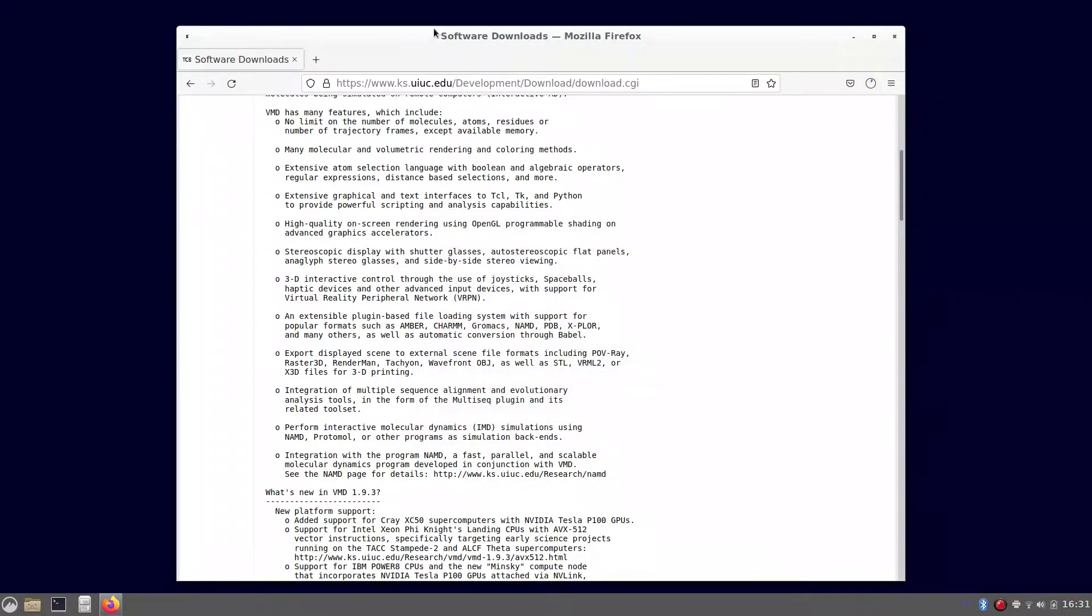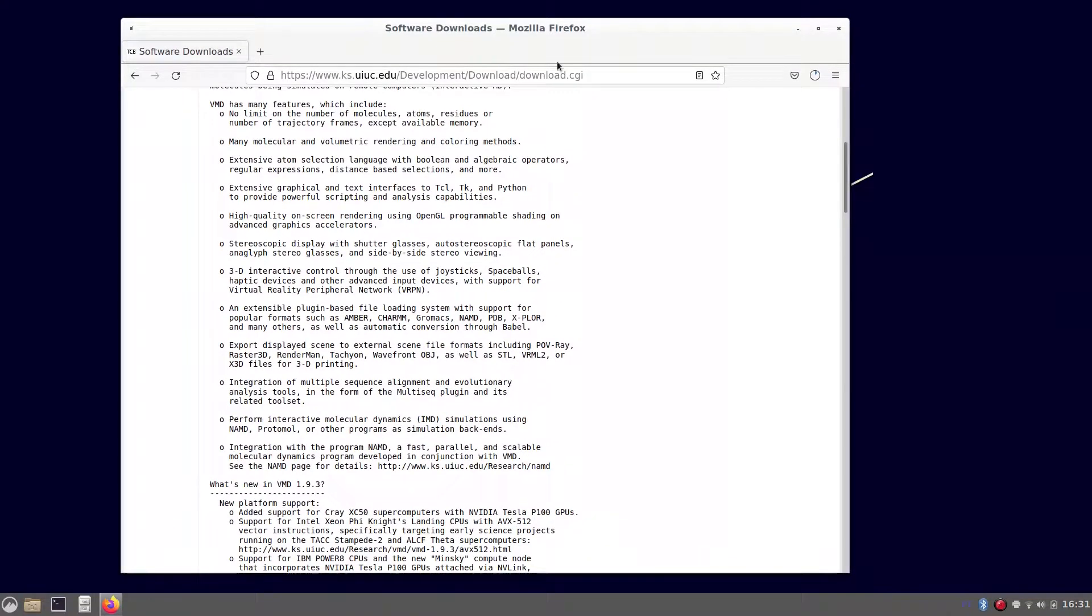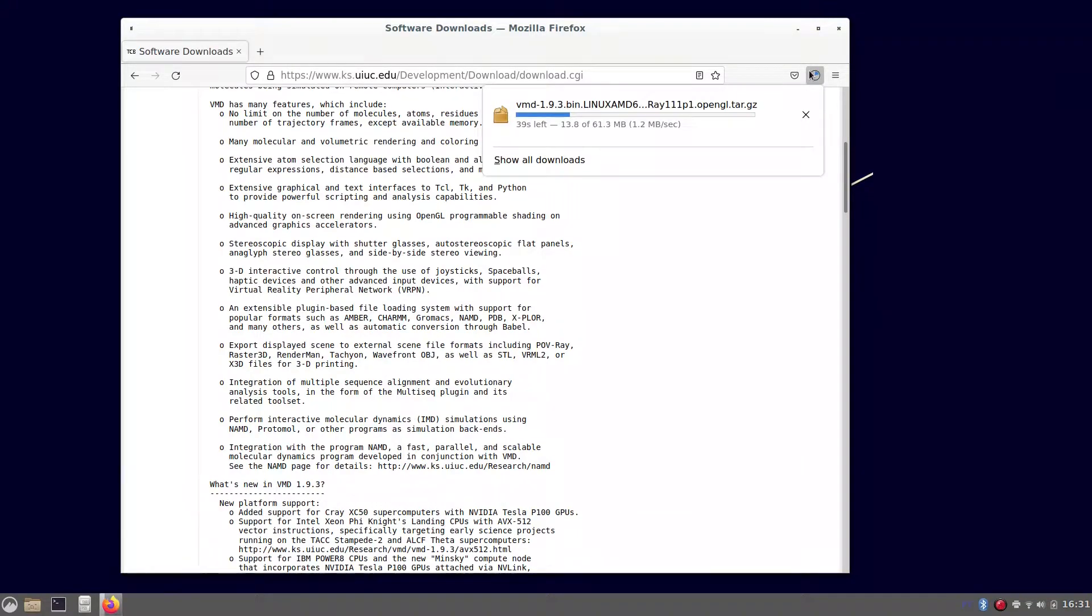Through the readme file you can take a peek on what is VMD. It's a really powerful software to visualize structures of biomolecules, to eventually determine or simulated, prepare or analyze molecular dynamic simulation data.